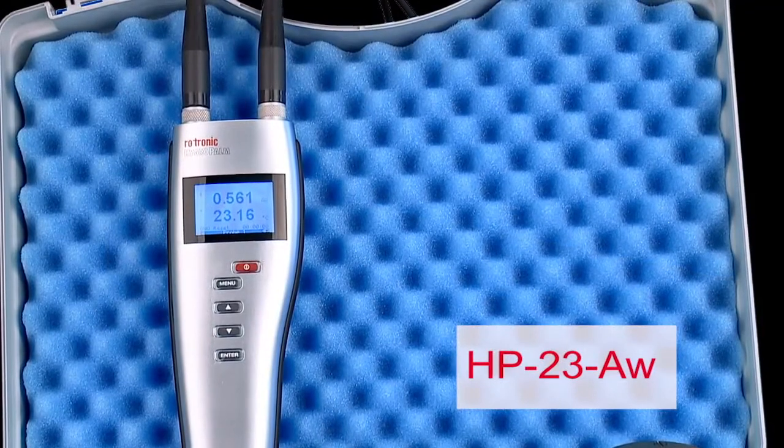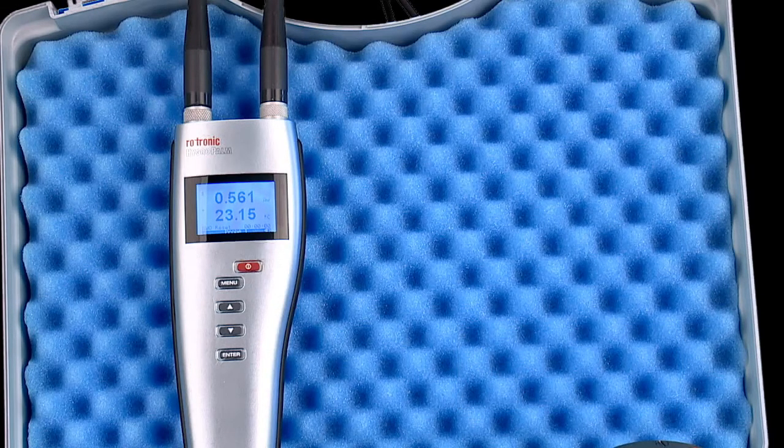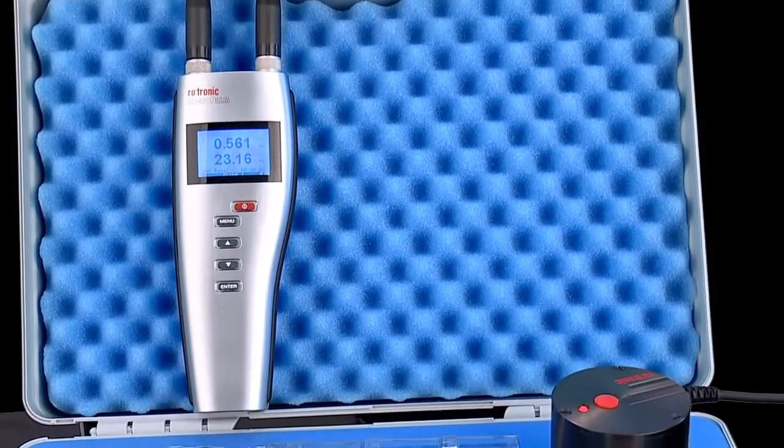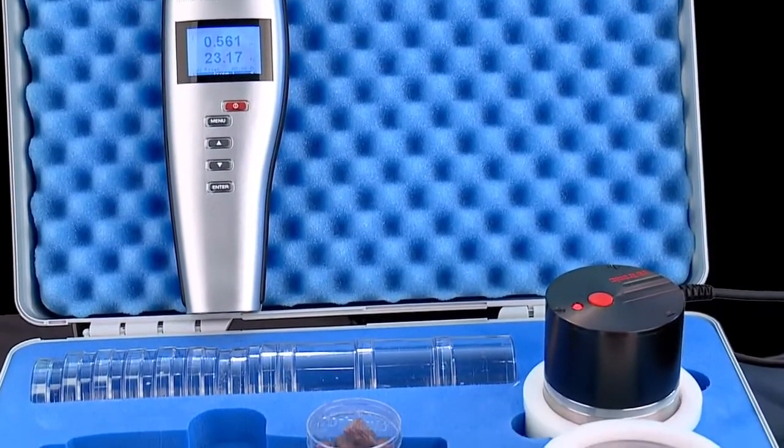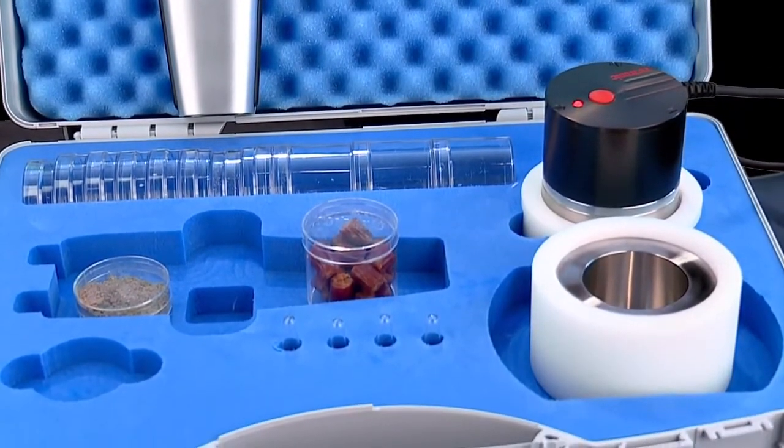Today I'm going to go into more detail using the popular HP23AW portable water activity instrument set. This set consists of three main components: the HP23AW handheld, the HC2AW measuring probe, and the stainless steel sample holder.